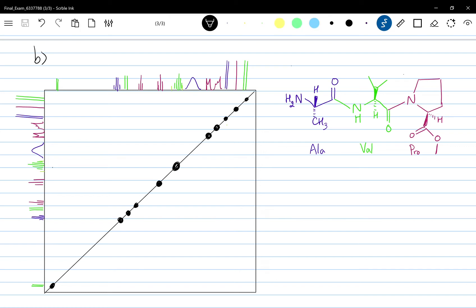Hi, my name is Paton Herobankan and today I would like to show you my interpretation of the NOESY spectrum of this alanine-valine-proline tripeptide. On the left hand side you can see the blank NOESY spectra with diagonal peaks already labeled, and also the proton NMR for this specific tripeptide on both axes. On the right hand side, I have the structure of the tripeptide with colored labeling which corresponds to the proton spectra on the left hand side.